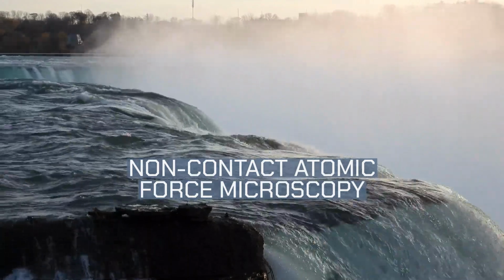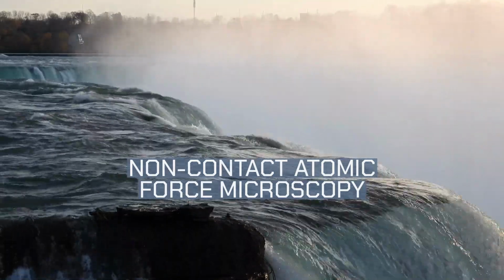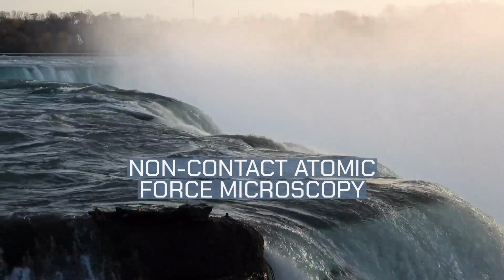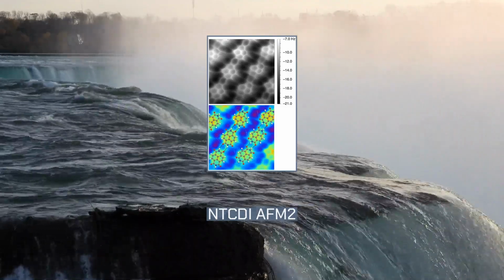Today, we're delving into non-contact atomic force microscopy. Non-contact atomic force microscopy, nc-AFM, also known as dynamic force microscopy, DFM, is a mode of atomic force microscopy, which itself is a type of scanning probe microscopy.